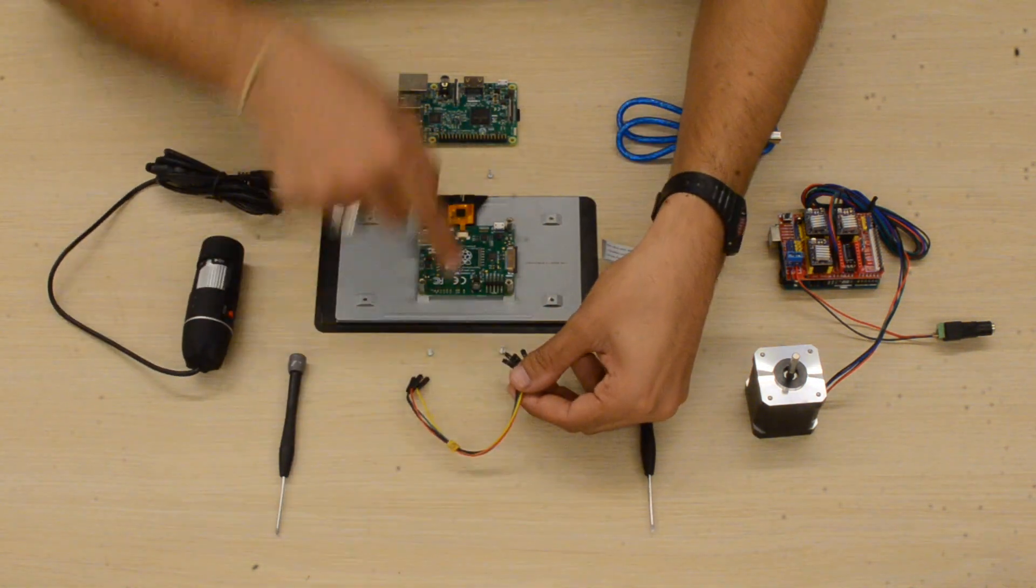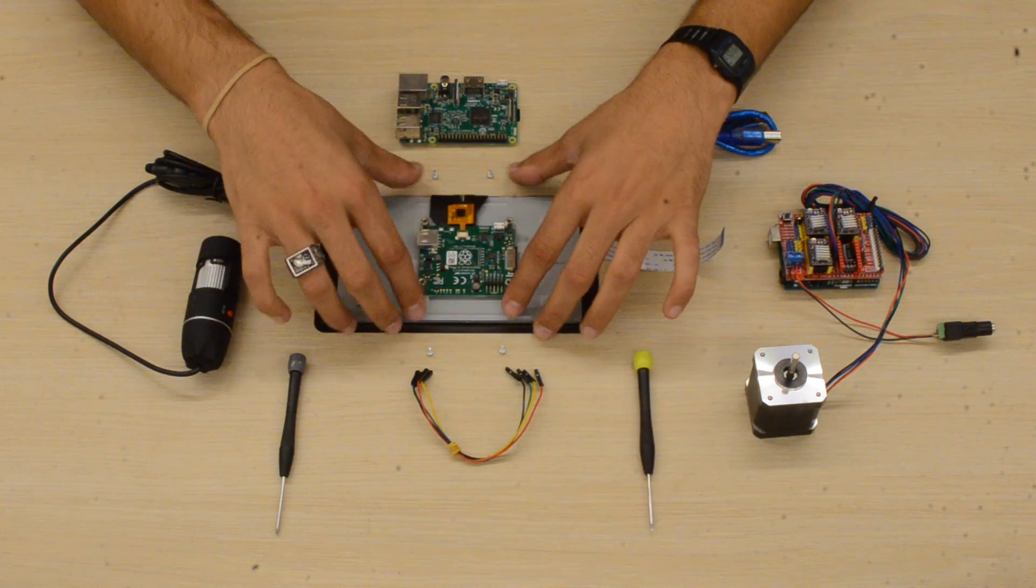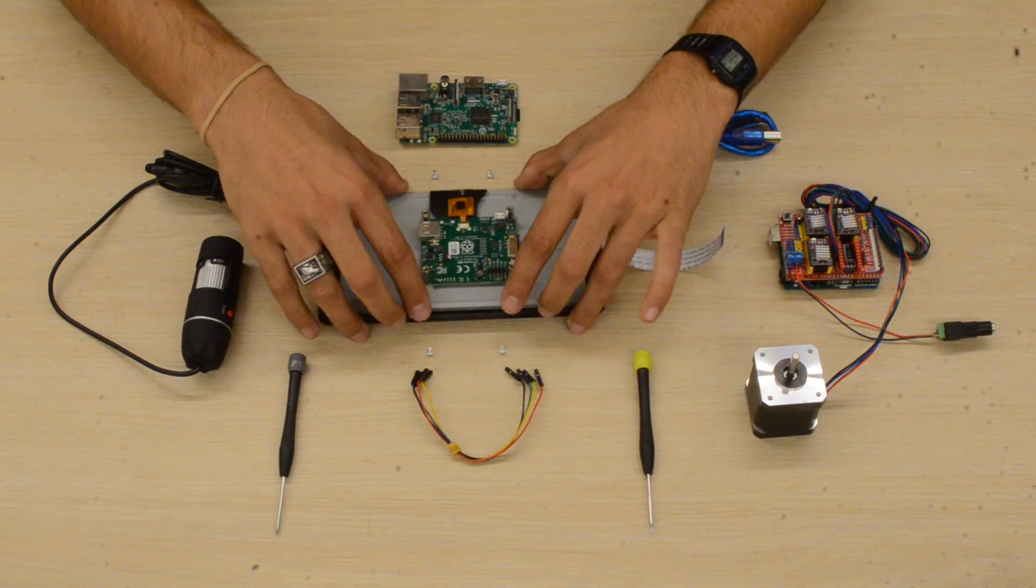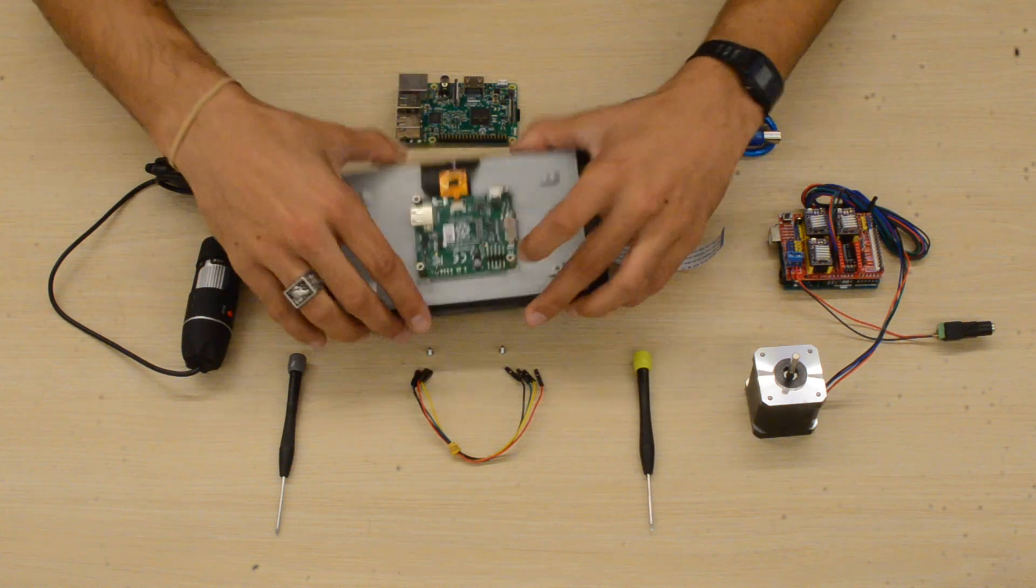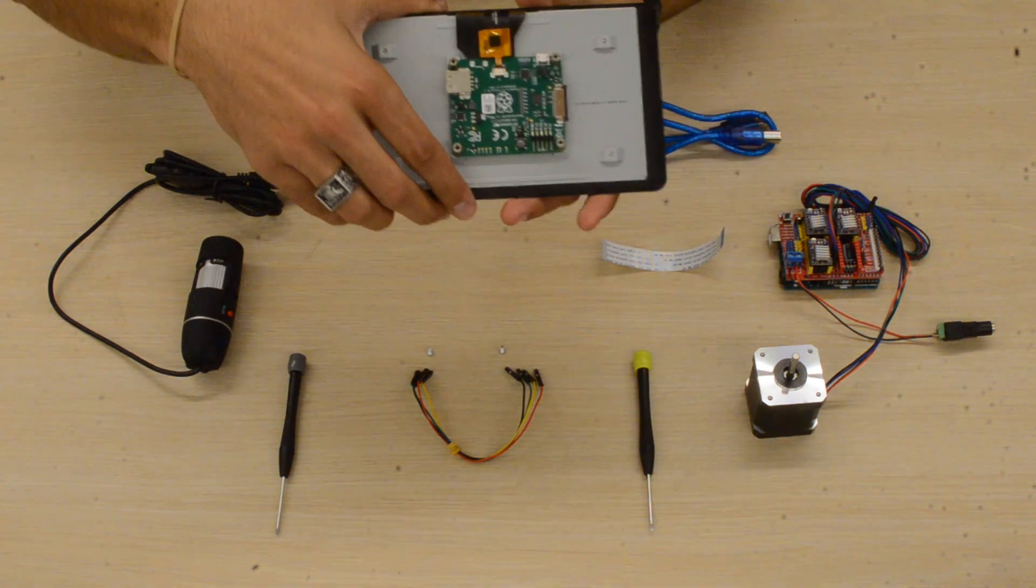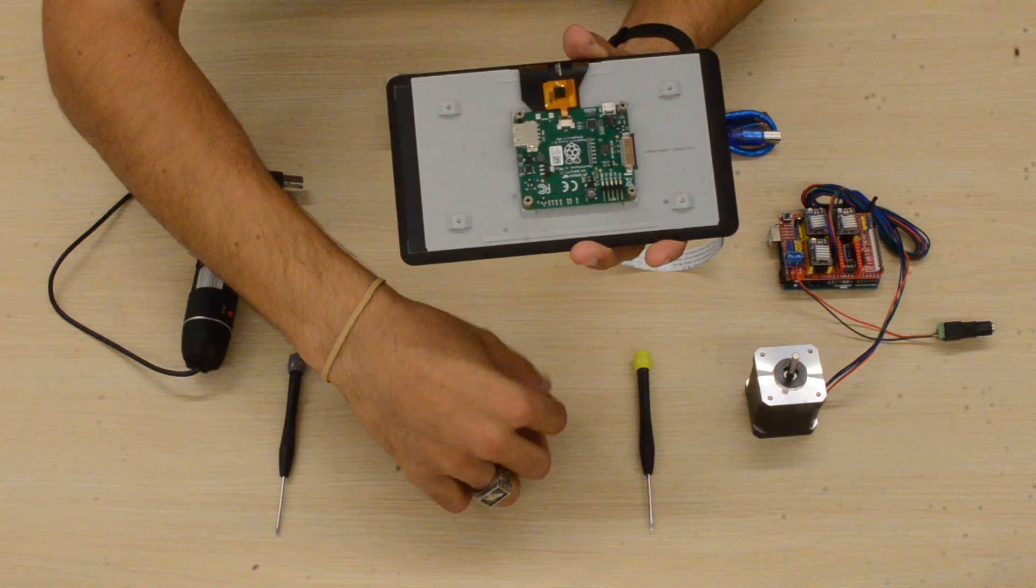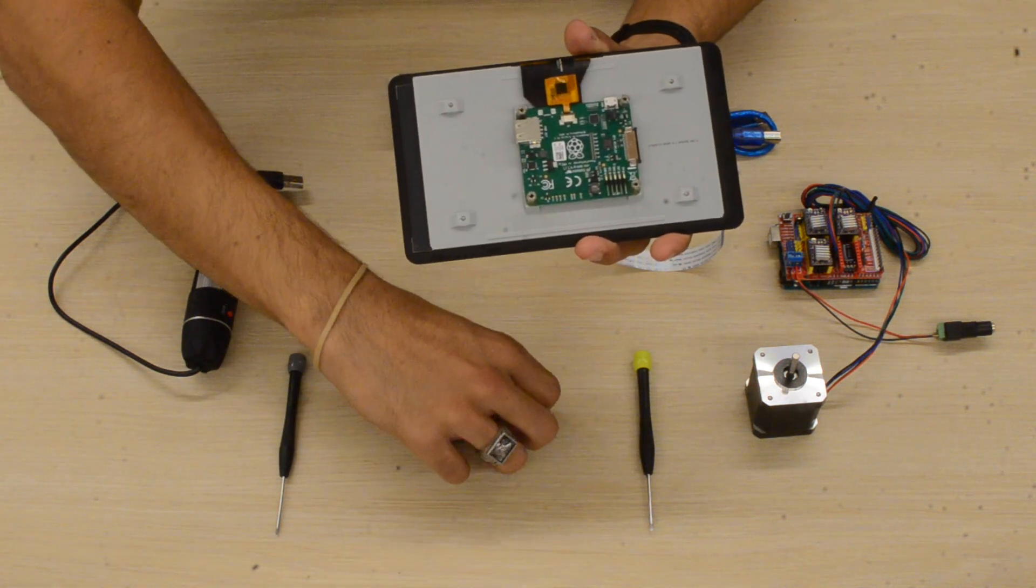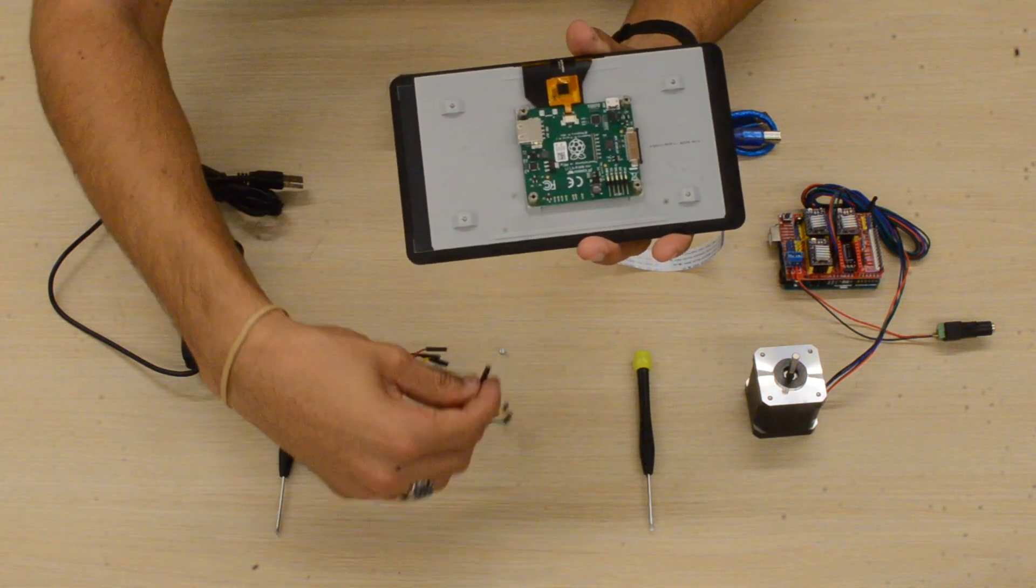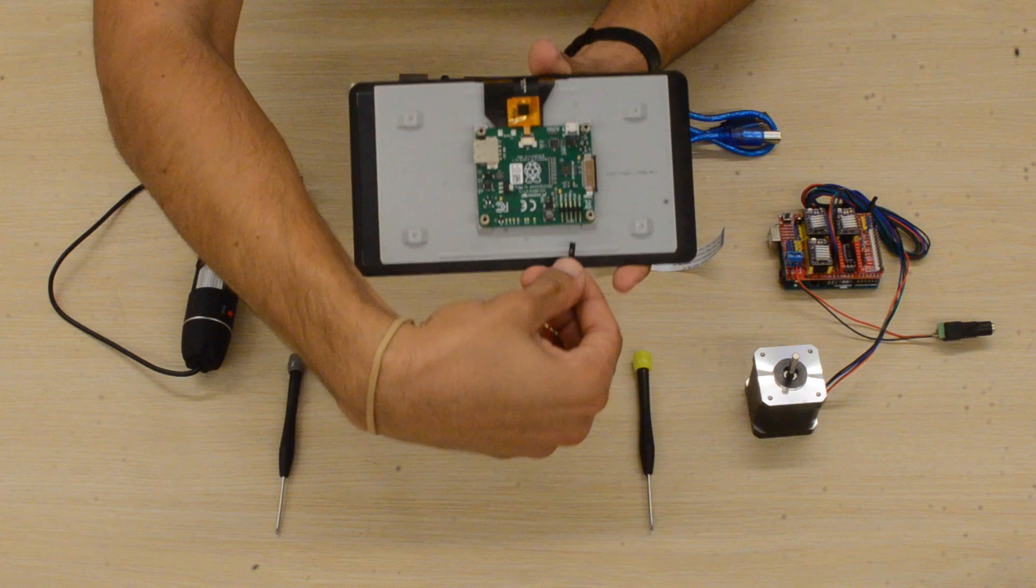Okay, so first we'll grab the four wires that come with the seven-inch touchscreen display and we're going to connect them to these pins on the back of the display. First, we'll grab the red wire and connect it to the rightmost pin.